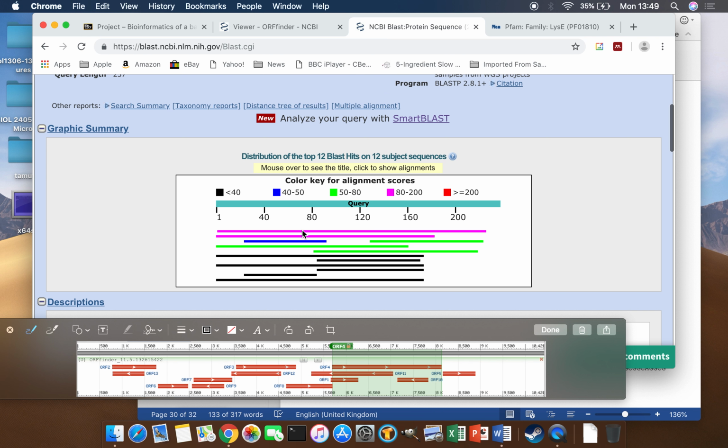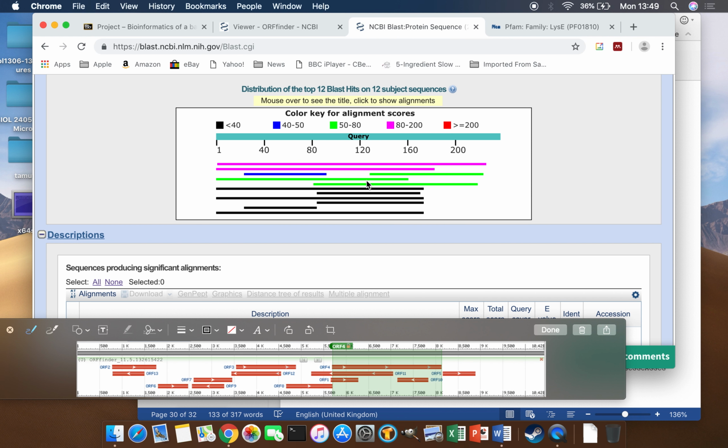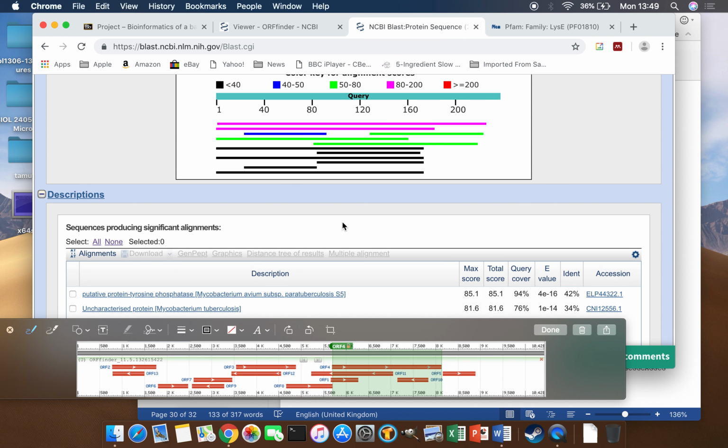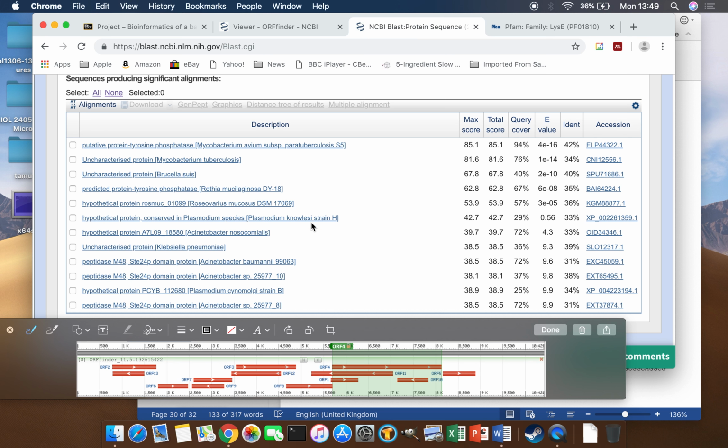Okay, so before we always had these nice red hits. Red hits mean really good, confident hits. Now we're getting purple, blue, green, black hits. These all mean, grain of salt. And the cooler the color is as you get toward this end, the more salt you're going to put on there until you finally get to the point where you say, I don't believe that. That's not well supported.